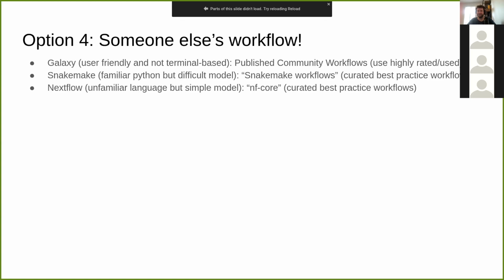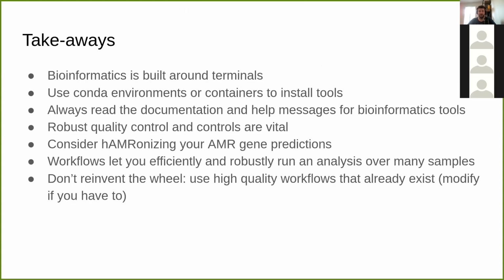He was at CDC, GenomeTrakr, and FDA, but has written a really nice Nextflow workflow that does a lot of bacterial genomics. If you're interested in mobile genetic elements as well, we've done some work in our group on something called ARETI, which is again a Nextflow workflow, but it's really focused on detecting AMR, lateral gene transfer, horizontal gene transfer of AMR in a big set of genomes. So if you're interested in that particular problem, that might be one solution.